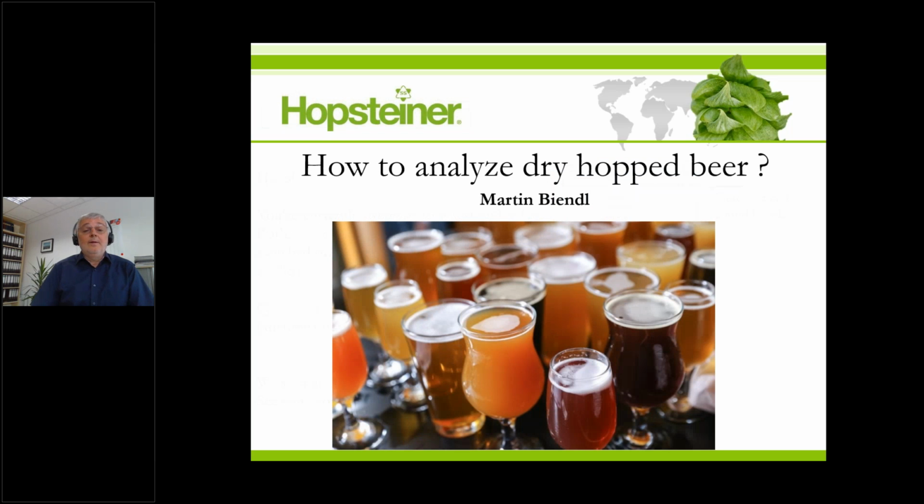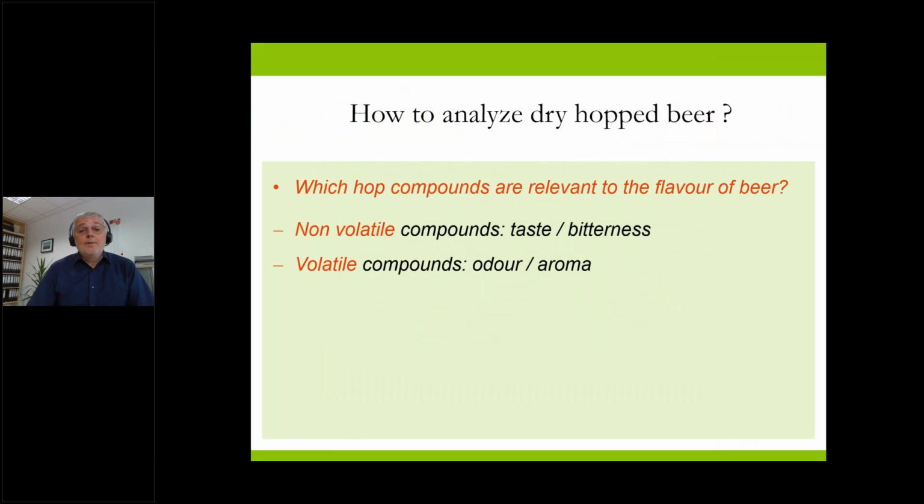I will inform you about the analysis of dry hop beers and try to solve this problem and what is special here with regard to dry hop beers. So, how to analyze dry hop beers? To be able to answer this question, we have to give some definitions in the beginning.